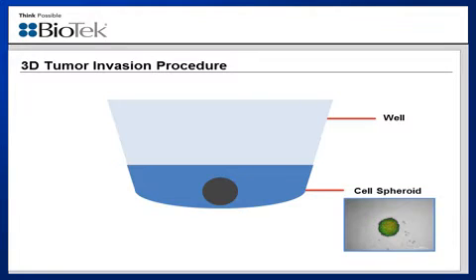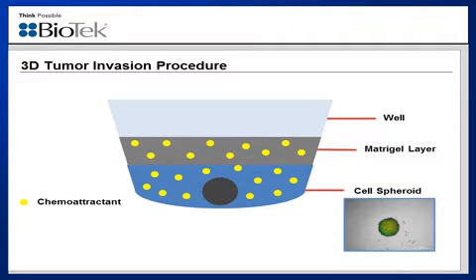You can also see the distribution of the GFP expressing breast cancer cells and RFP expressing fibroblasts within the total tumoroid structure. After aggregation is complete, 70% of the spent media is then removed and replaced with an equal volume of media containing chemoattractant. Diluted Matrigel is then added as an overlay, again containing chemoattractant.